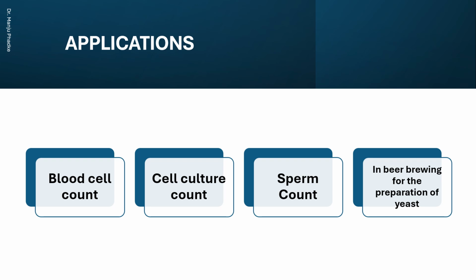It's a simple method. There is no great technical know-how required for this. And you simply have to mount the hemocytometer under the high power and start your counting.